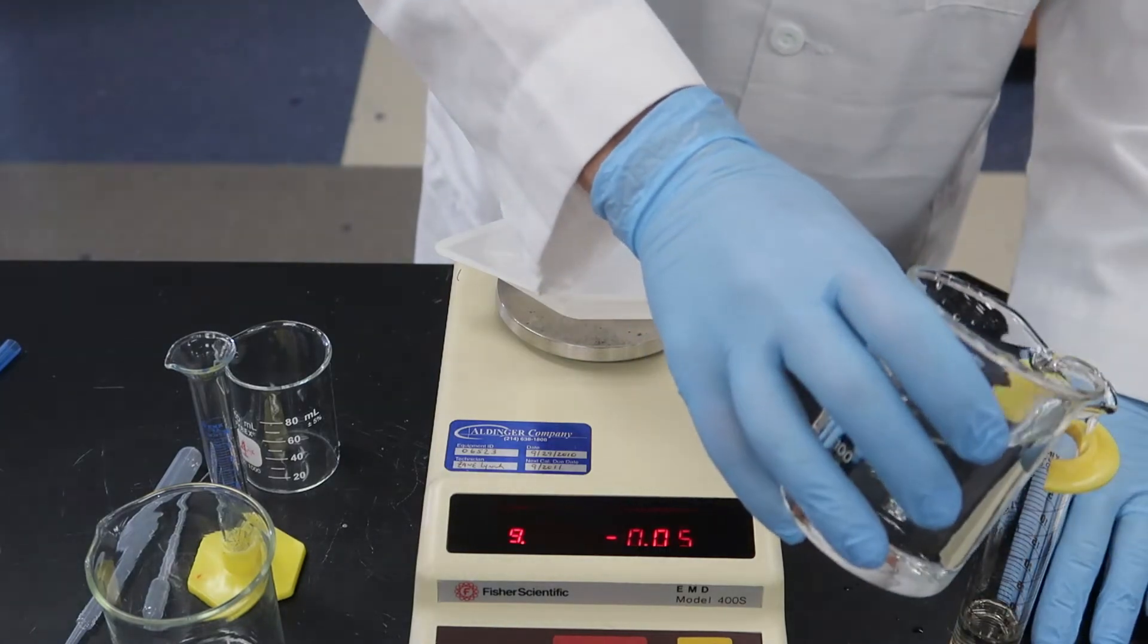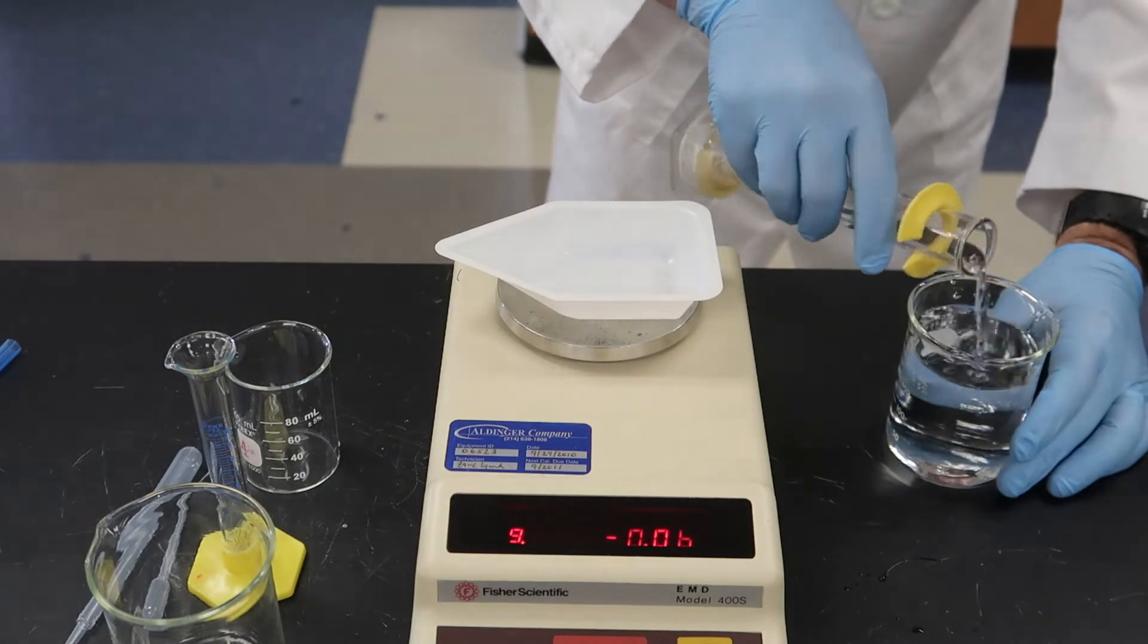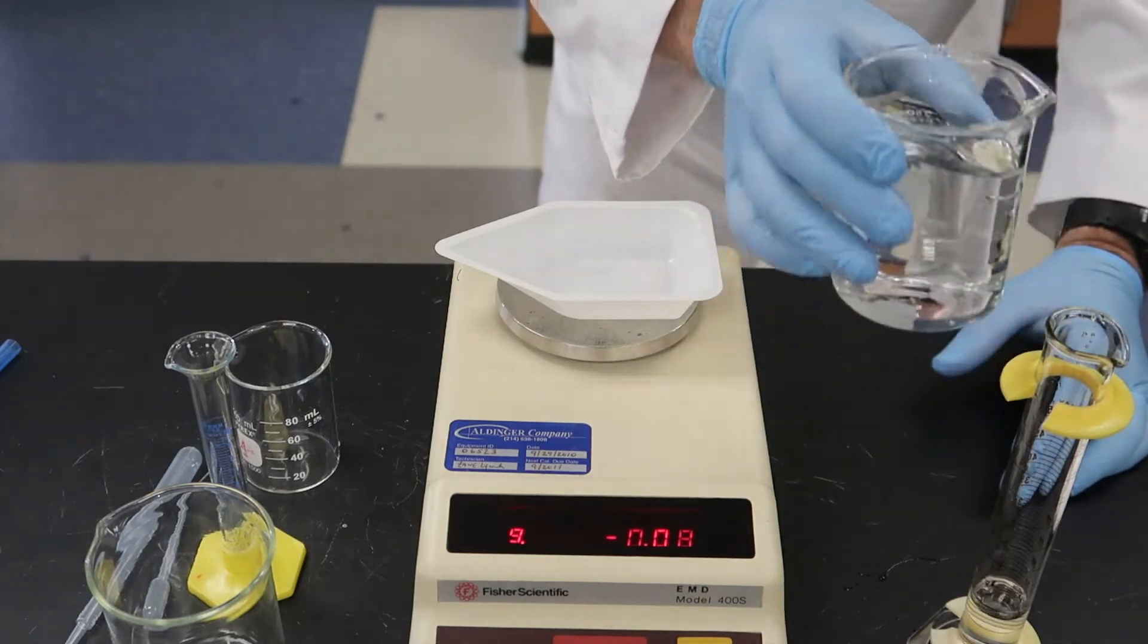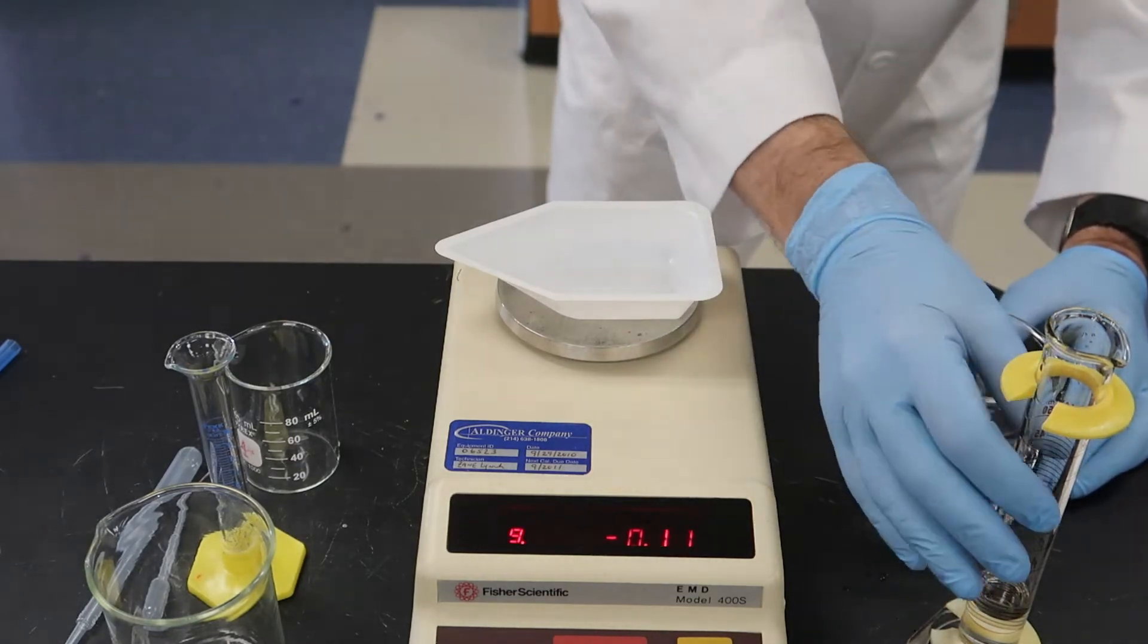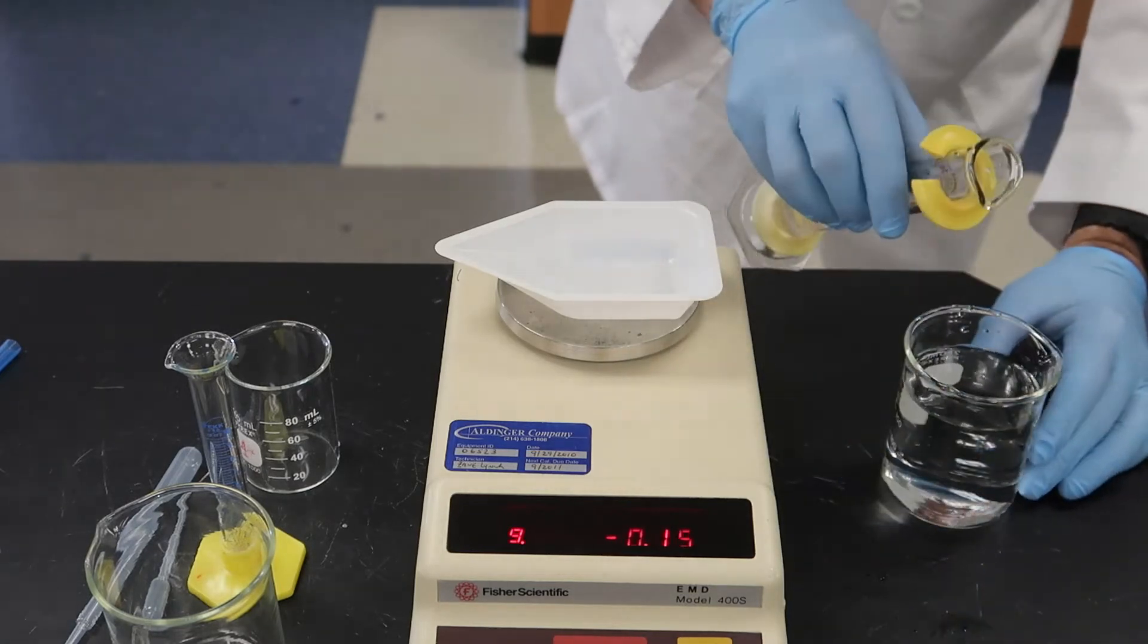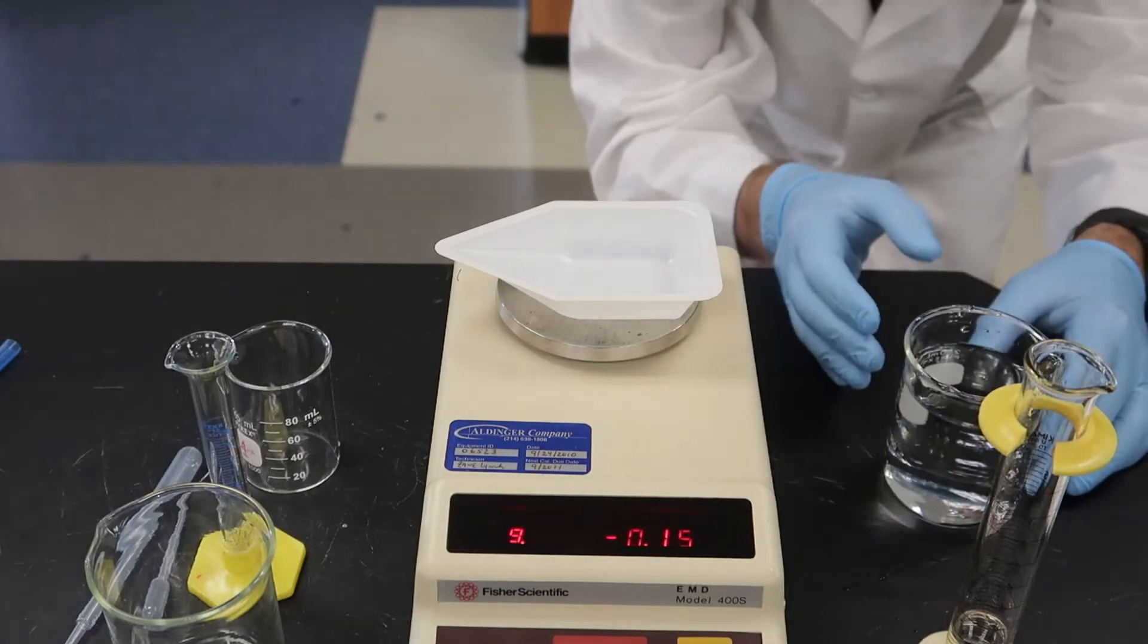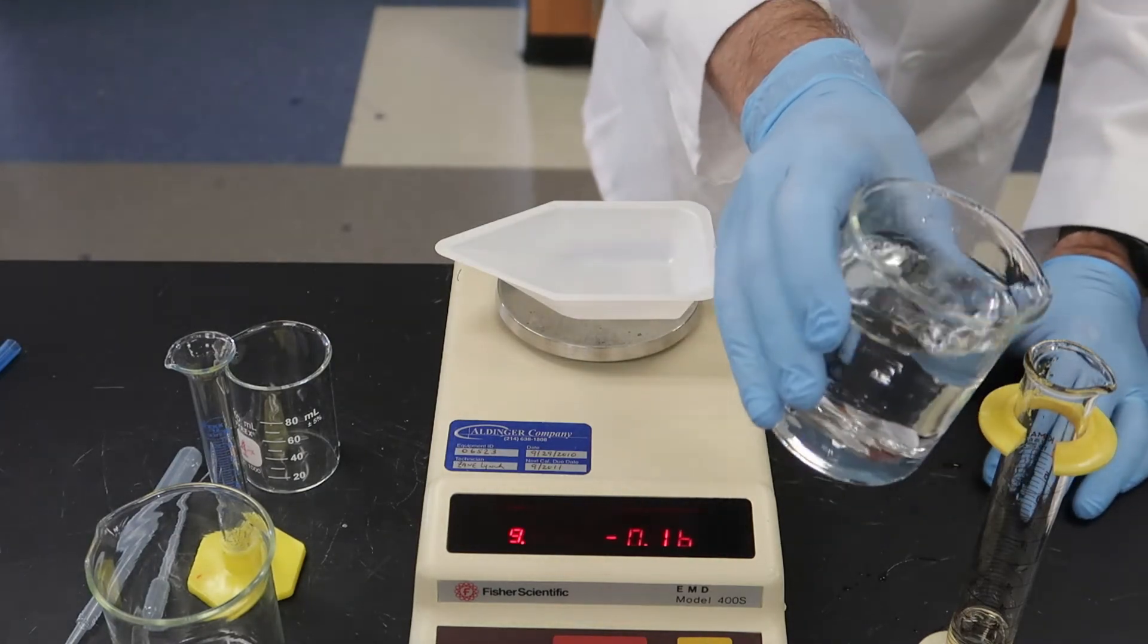And we'll see how accurate our volumes are by measuring the mass. Hopefully you already know that one milliliter should be one gram of mass if we're dealing with just regular water.